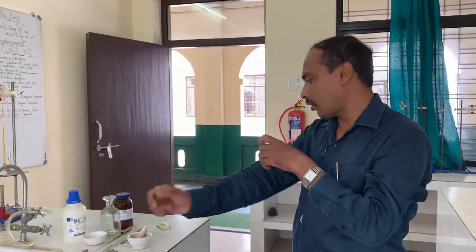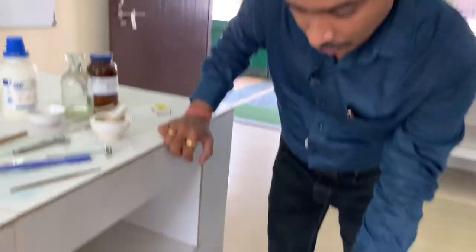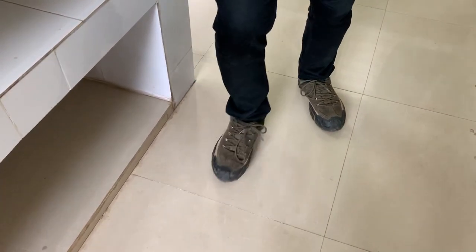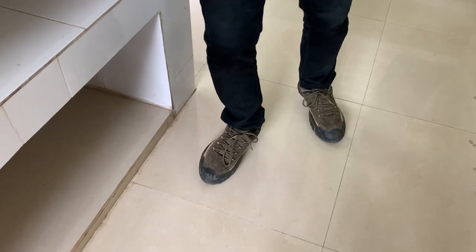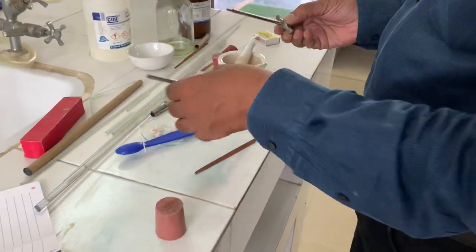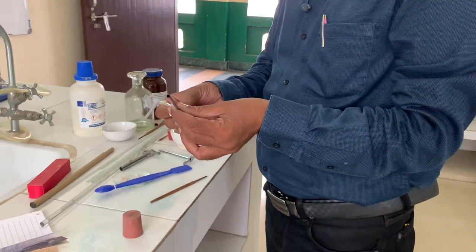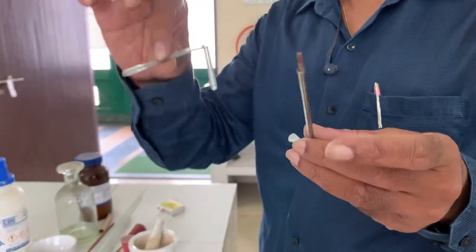Then boring a cork — how to bore a cork. This one is your cork. First, you press it, or press it by your leg. Why do you press the cork? Because cork is very hard, so by pressing with your leg it will become soft. After that, you take the cork borer. If you want to fit this glass tube in the cork, then you have to take a cork borer of diameter less than the tube — then it will be automatically tightly fitted.